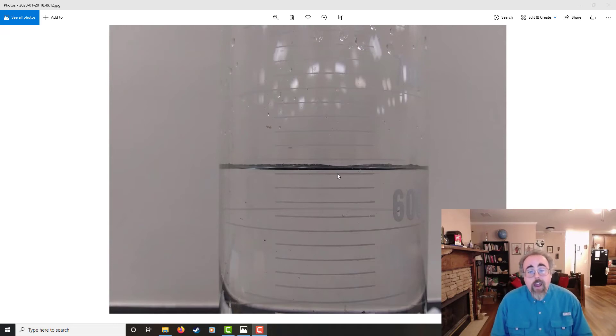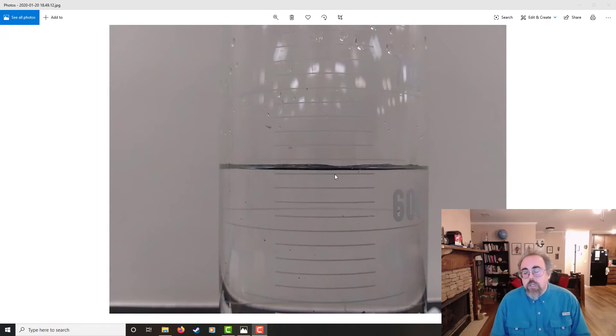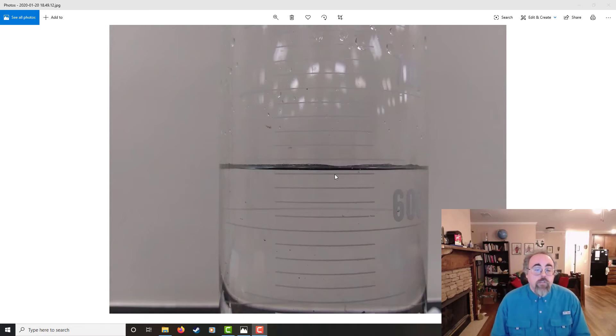By the way, if it was right on the line, I'd want to make sure I put my decimal point on. So if it was right on this line here, it would be 640, and I would definitely want to say 640 point, to clarify that that actually is three significant figures.